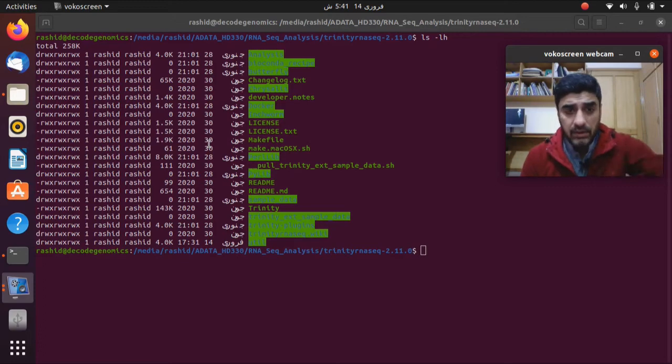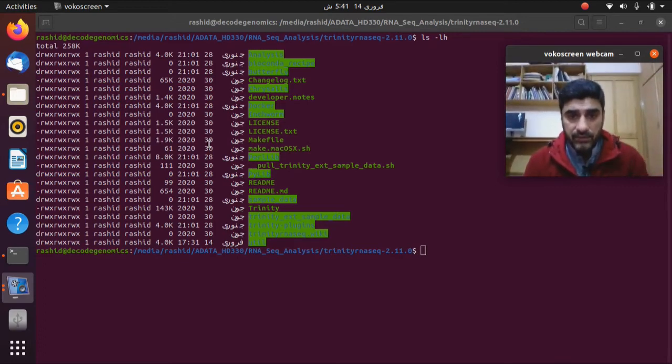You might have remembered that in step number 4 we generated 3 files. Those files are present in the utils folder. This is the folder where our 3 basic files are. So we are going to copy the required file into our next folder, that is analysis. I'm going to copy one of the files that we are going to use as an input file from the util folder into the analysis folder.